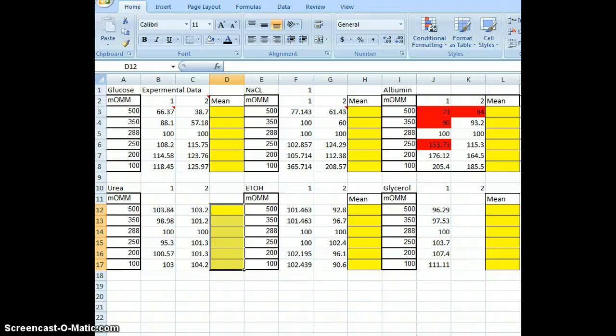This video is to show you how to do the graphing and the stats for the red blood cell permeability lab.